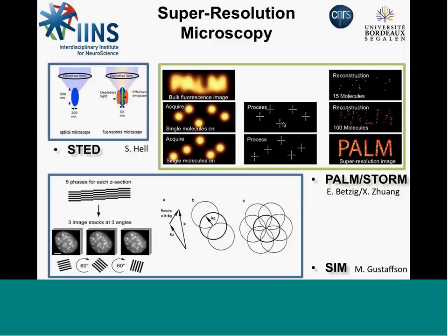This is a technique based on the localization of individual fluorophores. How does this technique work, compared to the two other techniques, which are deterministic methods? It means that you need to control exactly, in time and space, the state of your fluorophore, whether you want it in a fluorescent or non-fluorescent state. While in the single molecule method, that is completely directed by the stochasticity of the process.